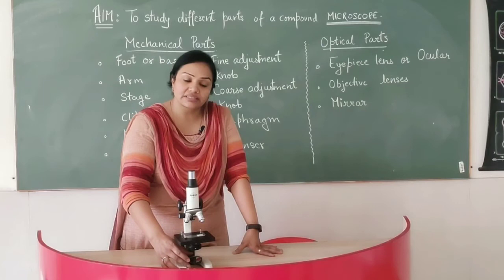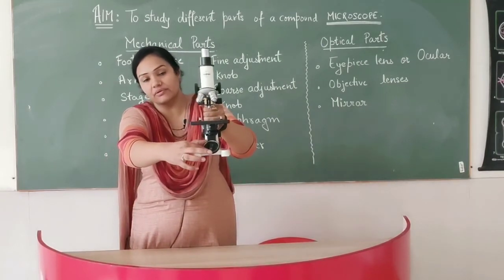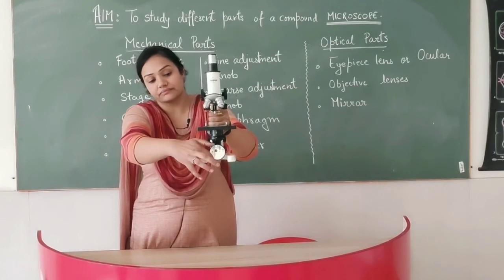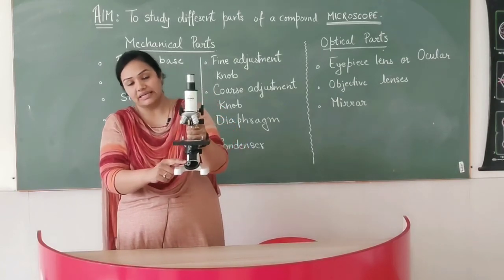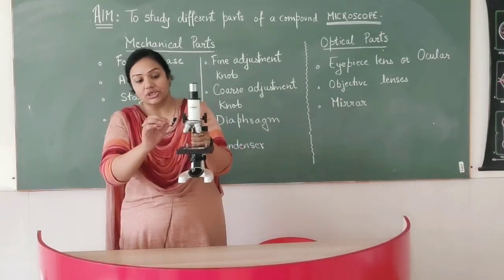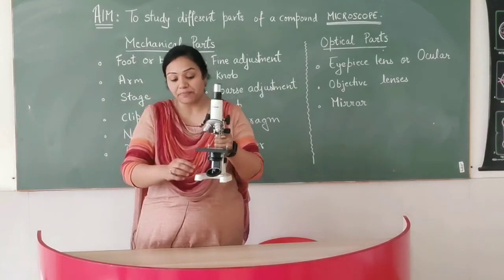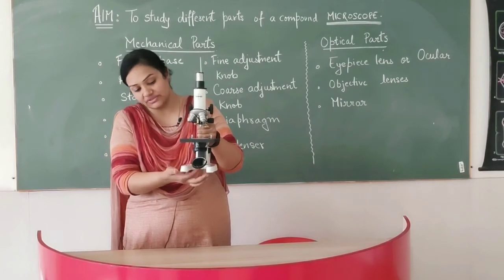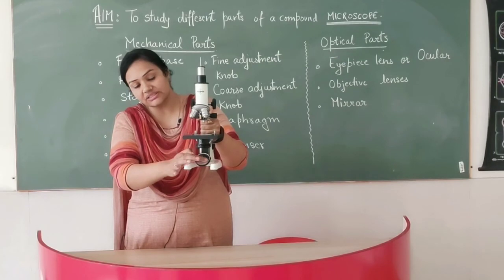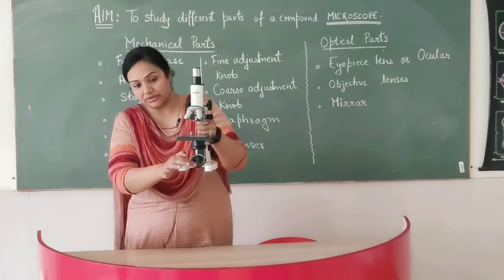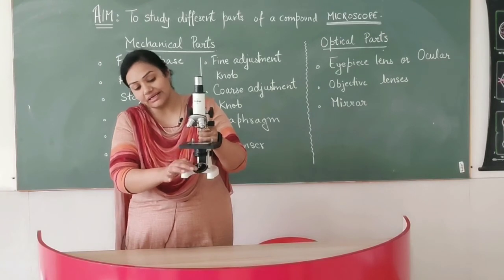The last but not the least is the mirror. If you see carefully, you can see we have a mirror here. The function of this mirror is to focus light on the stage so that we can easily clearly see the object on the stage. This mirror is having two surfaces. One surface is a plane mirror and the other surface is a concave mirror. So we have two types of mirrors on this surface, plane mirror and concave mirror.